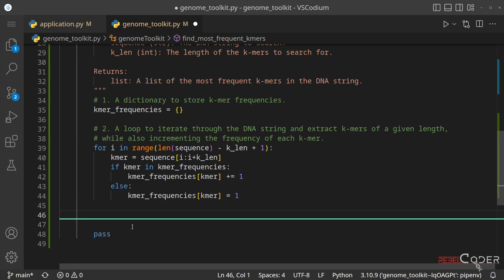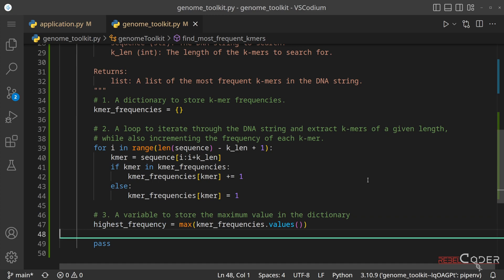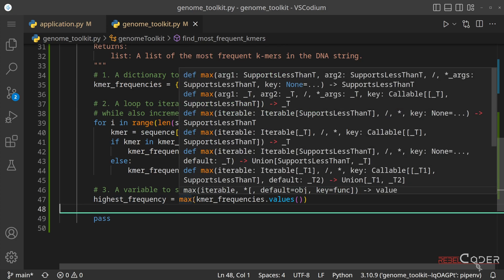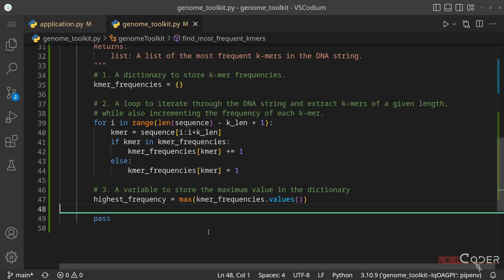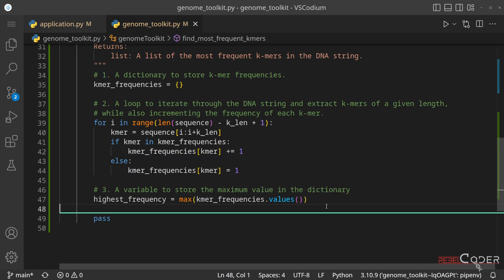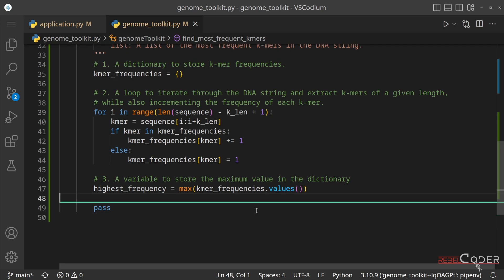The third step is to find the highest value in the dictionary — the K-mer repeated most often. We store this in a variable called highest_frequency, using Python's built-in max() function on the dictionary's values, not keys. This returns the highest frequency as an integer.